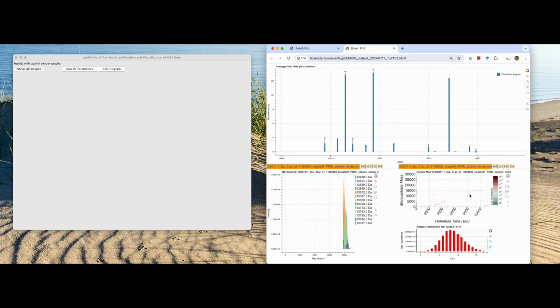If you loaded an MS1FT, those files happen to also have the isotopic distribution information for different masses. The dot feature files from TopFD do not have this information. So you can go in and click some of these masses. It gets a little bit tricky because if there are multiple ones there, it gets confused. You can take a look at the feature maps of each of the different LCMS data that you're interested in.